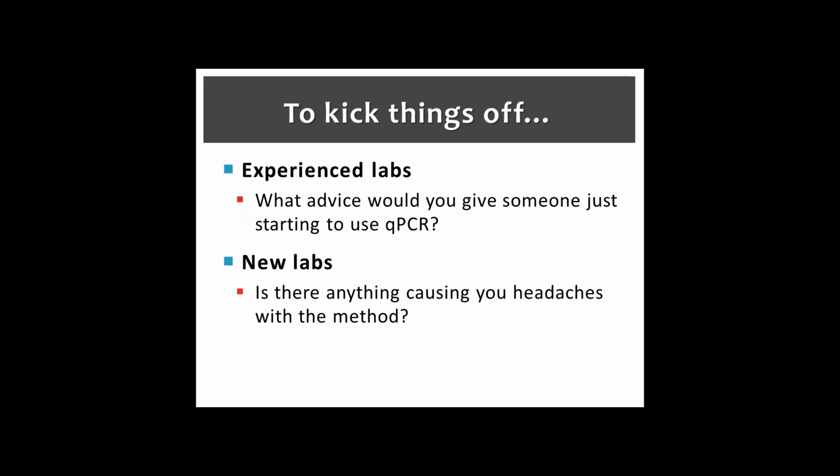How many different species of the primers and probes do you have? Do you have a human set already? Do you have bovine and that sort of thing? Well, like I said, the EPA has focused, for obvious reasons, on human markers as the first step in that process. Actually, a lot of laboratories have developed various assays for dog, deer, cow, pig, and so forth, including the EPA. But in terms of a validated method, human was considered to be the top priority, and that will be coming out first.